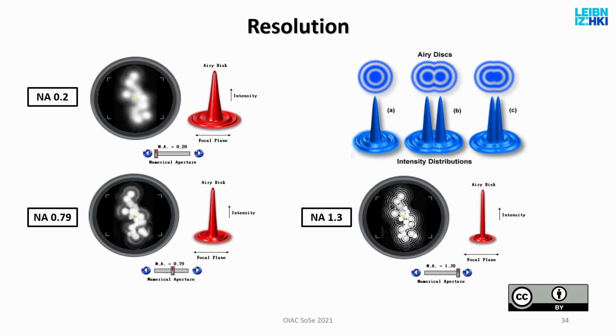Well, imagine the following. You have one object below resolution, what you see in your microscope is this interference pattern, the Airy pattern. So I know that my object is here, but I don't know how big it is. If I have two objects which are very close to each other, they will both form an Airy pattern, but what I will see in the microscope is this, a blob. And I will not know how many components there are in here.